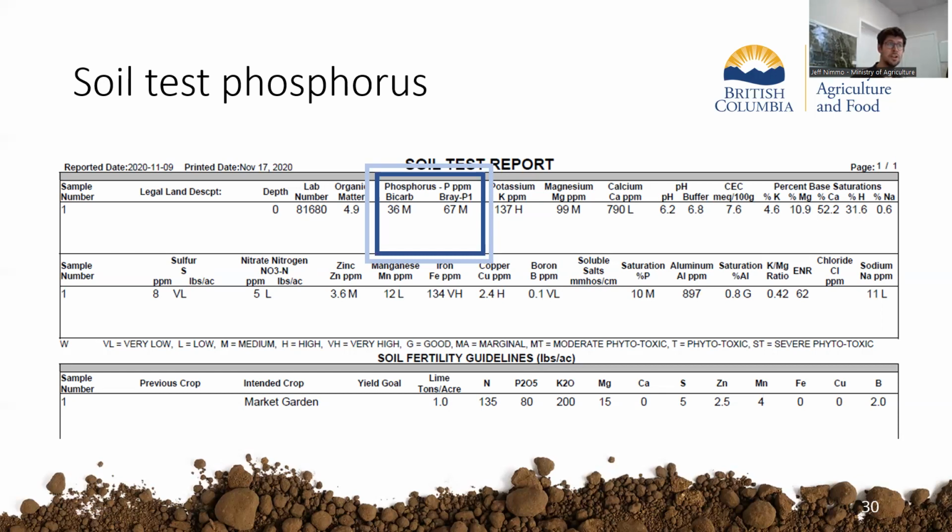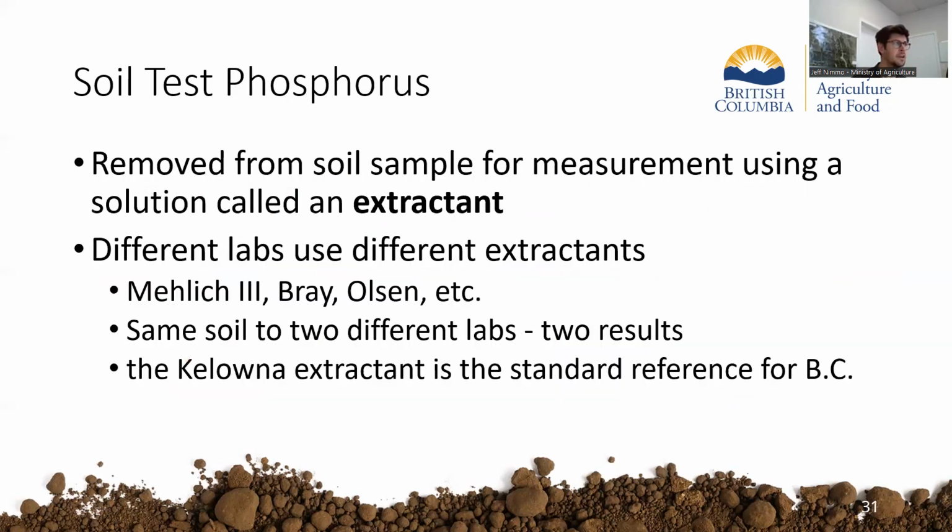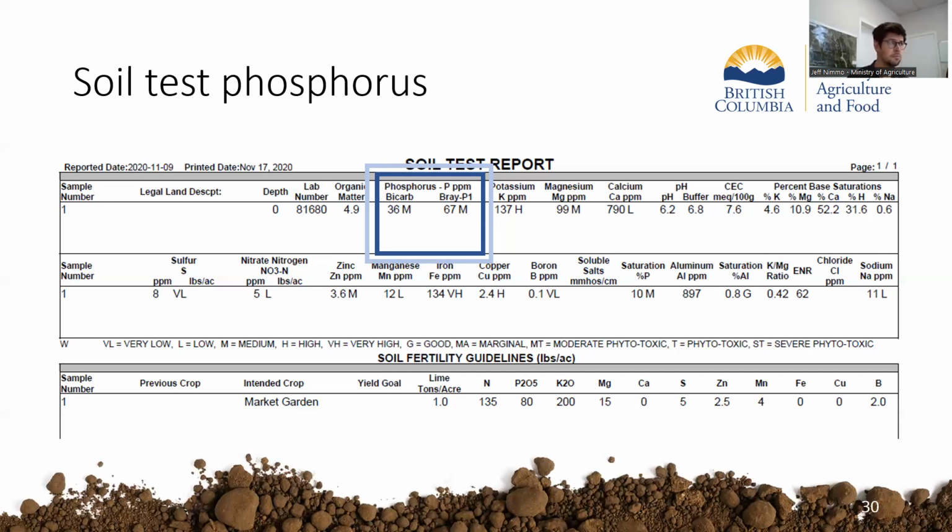And so depending on where your soil pH is at, so I believe this one, we've got an example where soil pH is sort of down into that more acidic range. Likely we should be looking at the Bray extraction to interpret that. They both ended up with a medium rating, so not a whole lot of differentiation there, but just be aware that there is a bit of a different use for the different extractions.